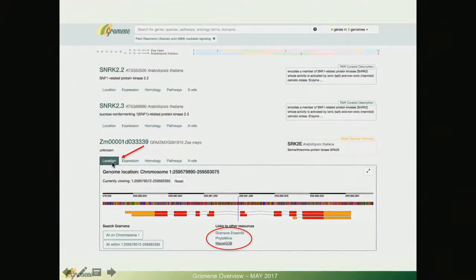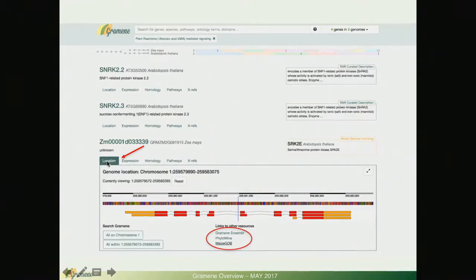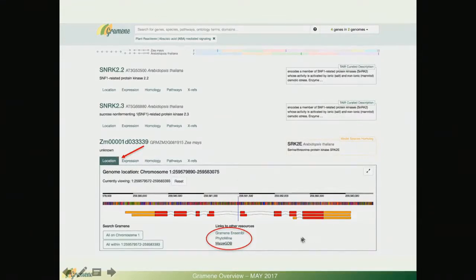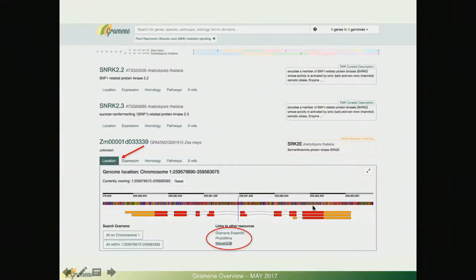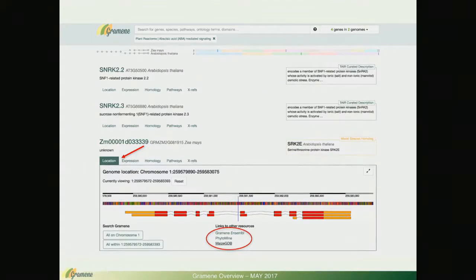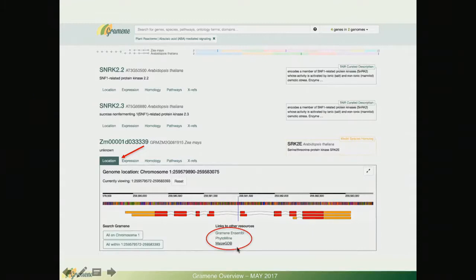Now let's go back. That was the homology tab. I am going to show you what you can expect to see in the location tab. This is the genomic context. It shows the gene structure in a lightweight genome browser and you can follow the link to the Ensemble browser or other resources for more details.